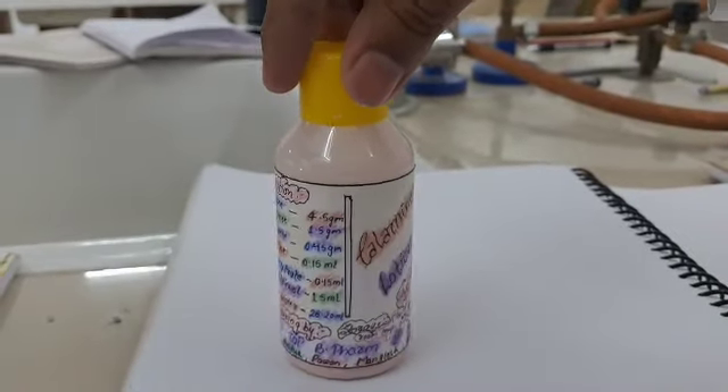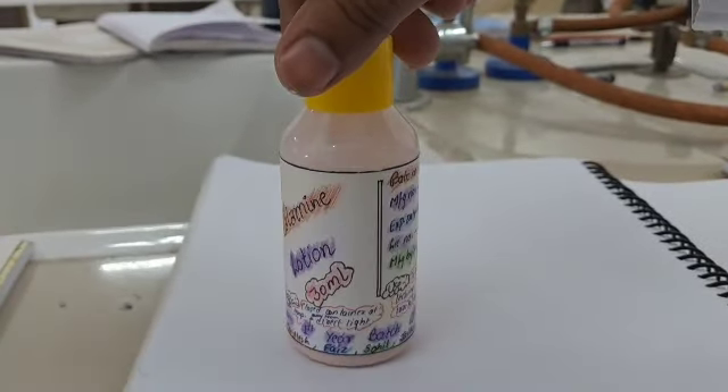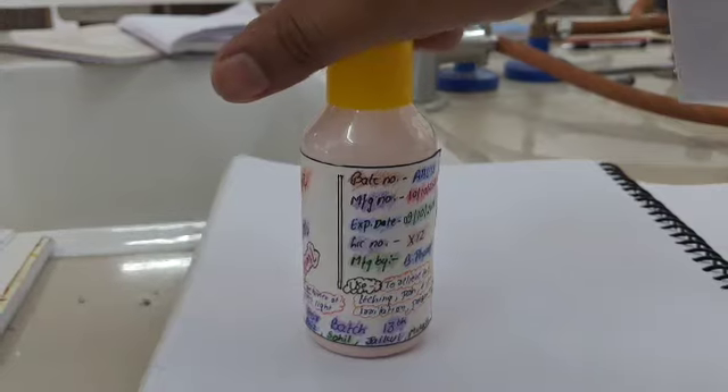The object of the experiment has been achieved. We have prepared and submitted 30 ml of calamine lotion successfully.